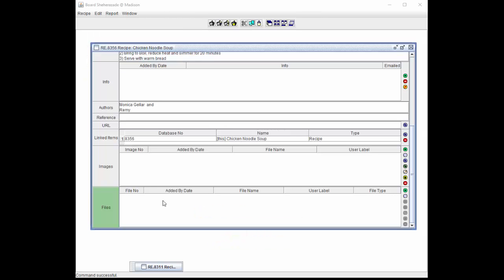The file field is a list of files that have been attached to a record of interest. The table is manipulated using the buttons on the right. The Files field can be edited by clicking in the Files field. The header of the field will turn green, indicating the field is editable.